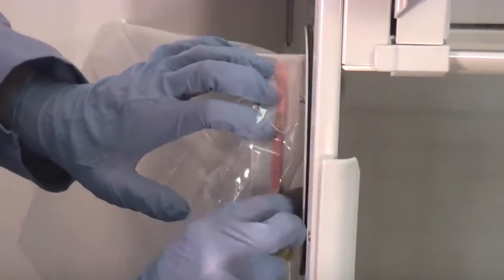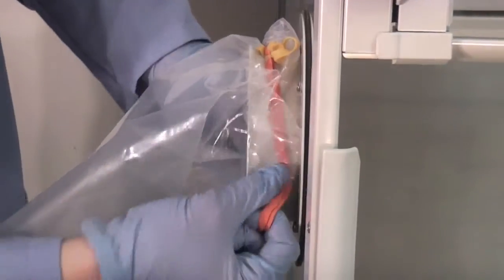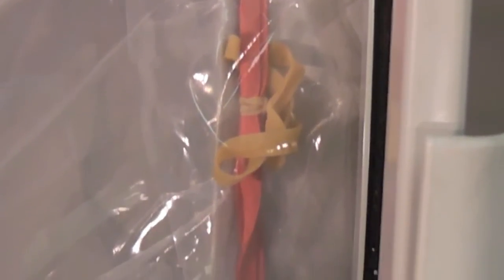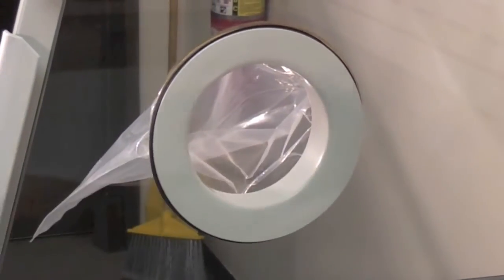Using the pull loop on the retaining band, lift the band away from the flange and tuck the bag underneath, carefully working your way around the opening to ensure attachment. Remove the waist chute stopper and store inside the enclosure.